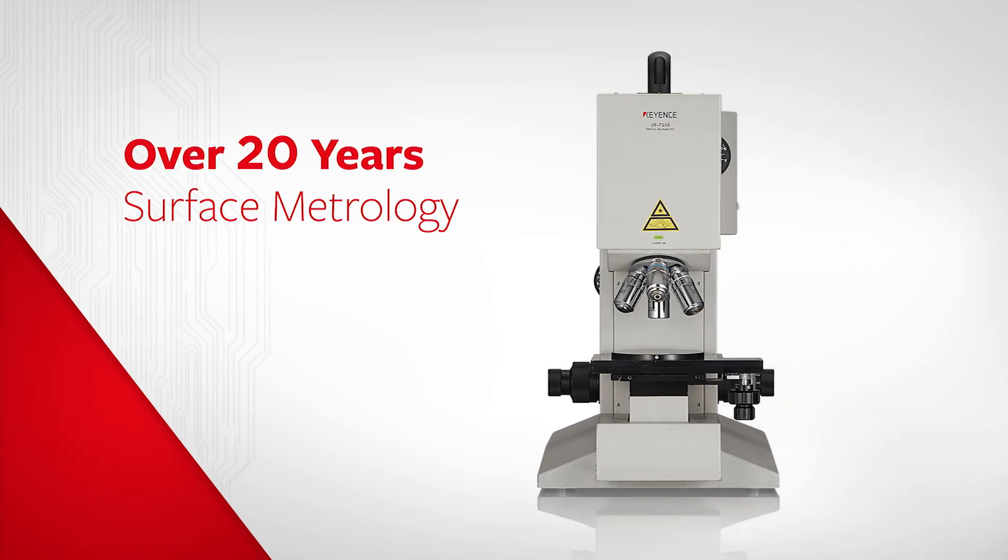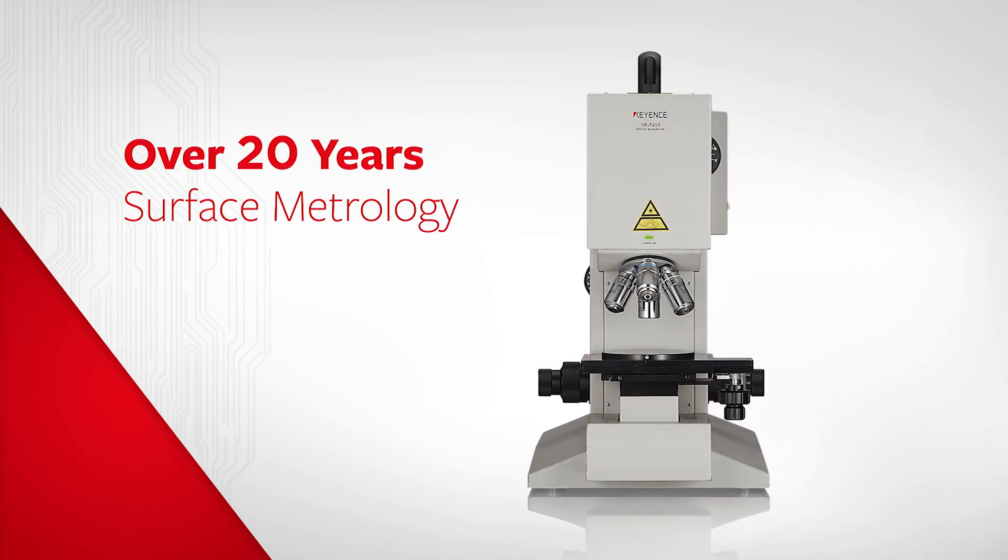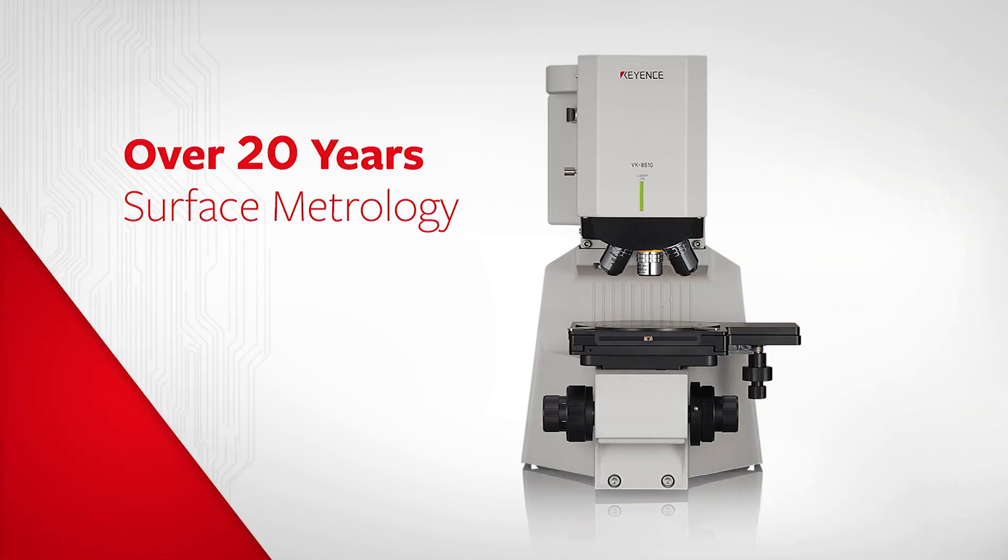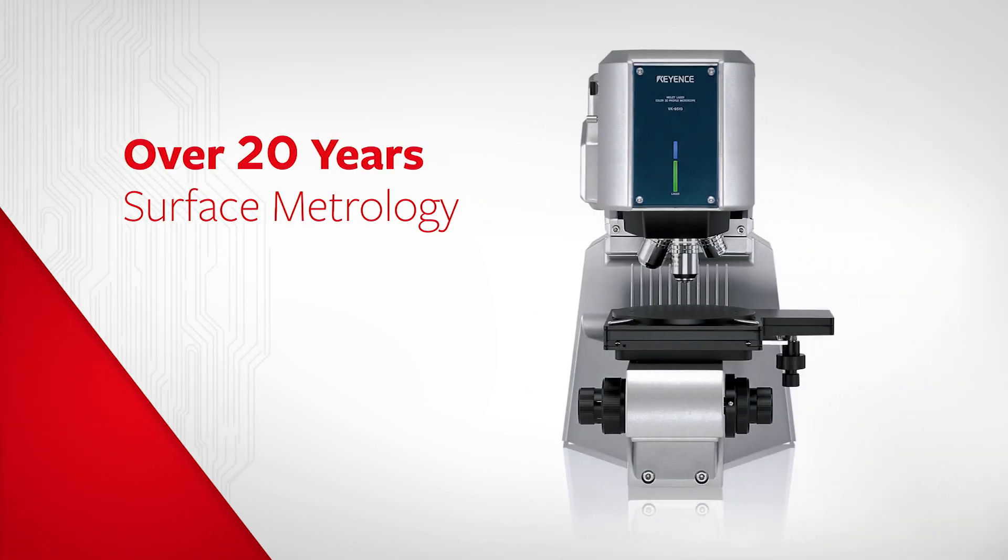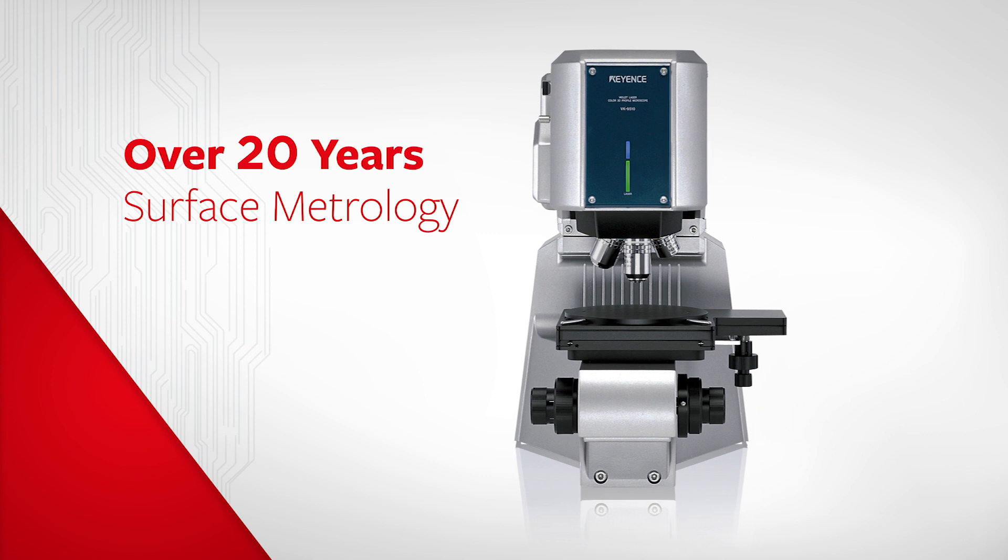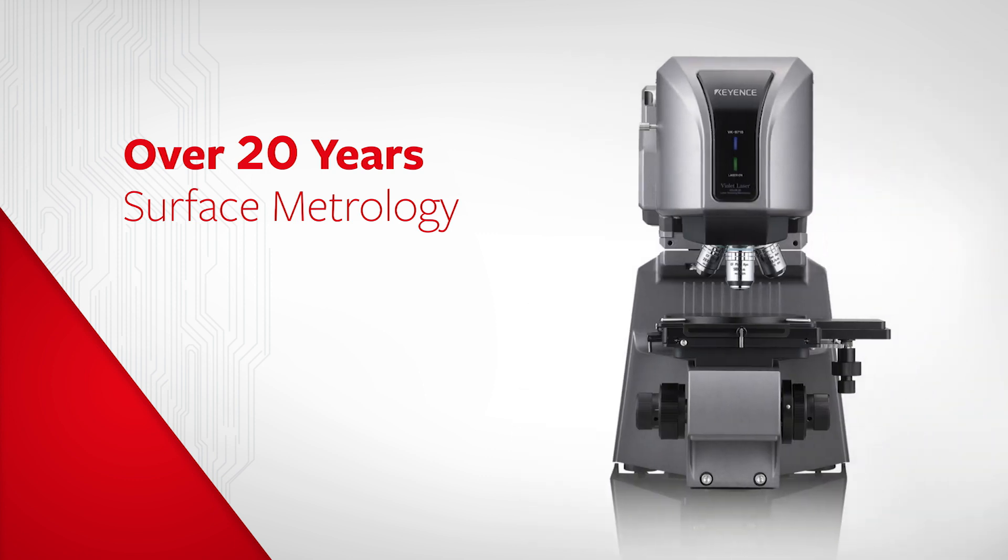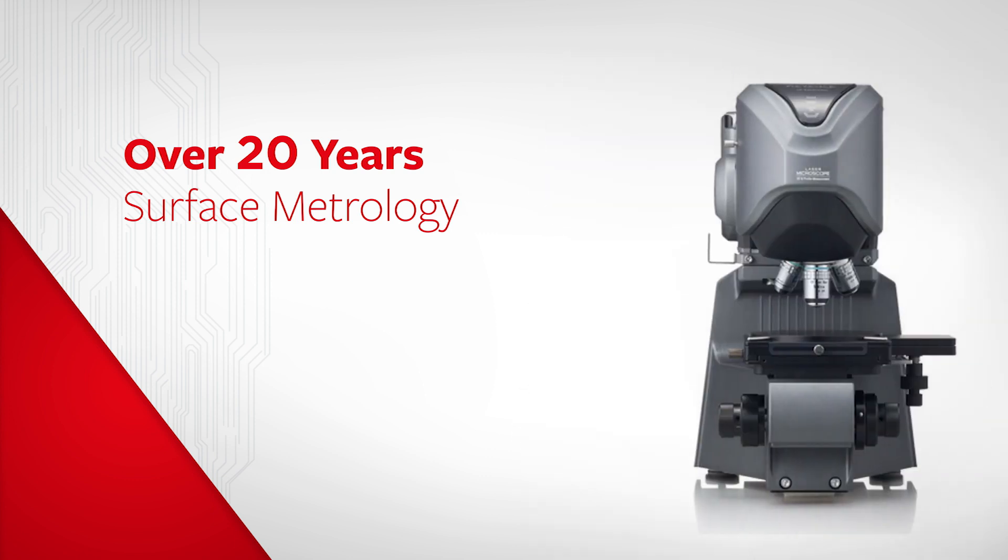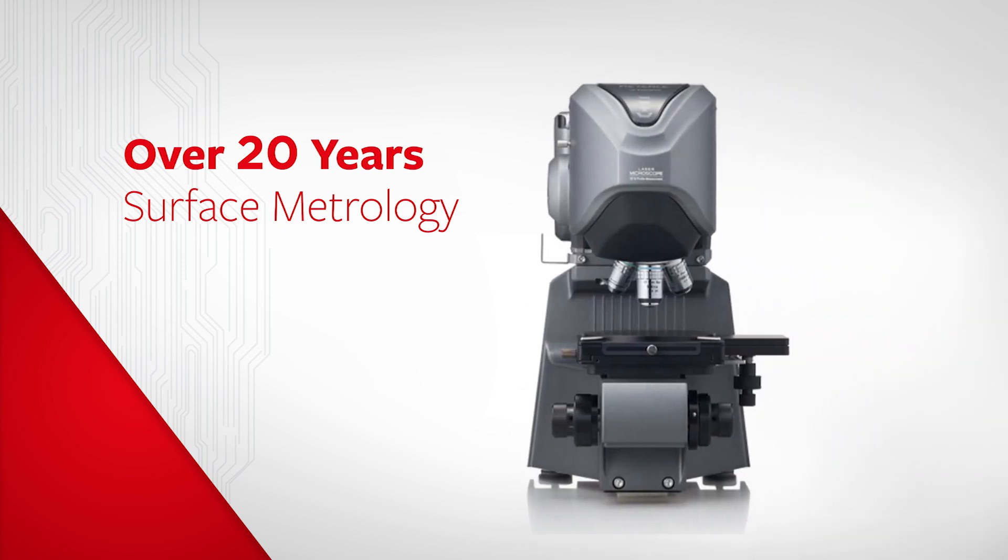With over 20 years of innovation in surface metrology, Keyence has combined several innovative technologies into an all-in-one 3D measurement tool for both shape and surface analysis.